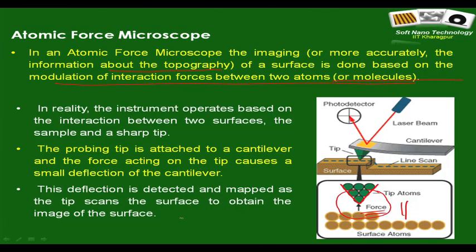So, this is something I told: between two molecules the van der Waals interaction goes as 1 by r to the power 6, but between two surfaces it scales as 1 by r square. There is something you will learn in great detail, and when you bring a tip close to a surface, there is some active van der Waals force, and you rely on that to utilize an AFM. The practical difficulty is how do you measure.